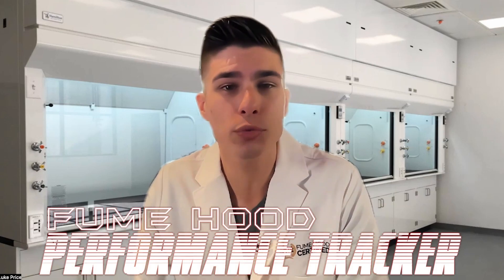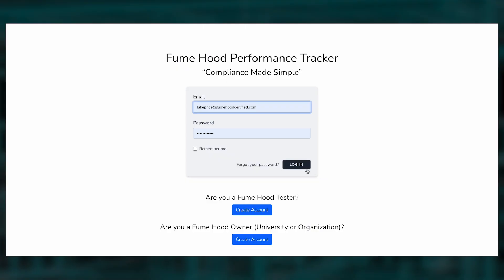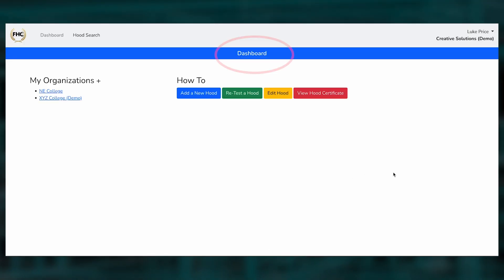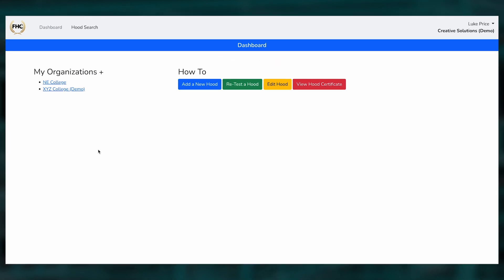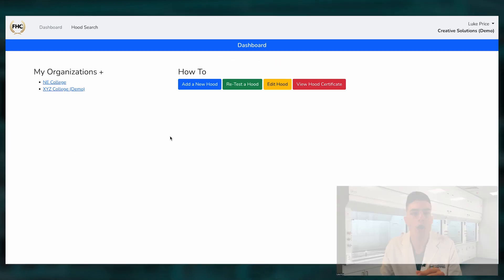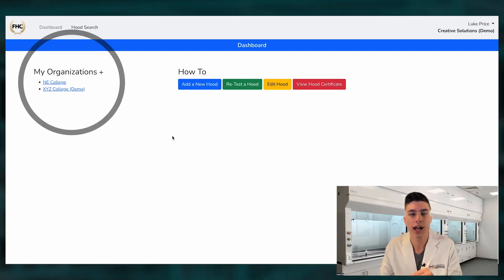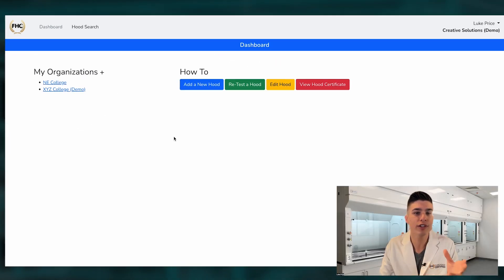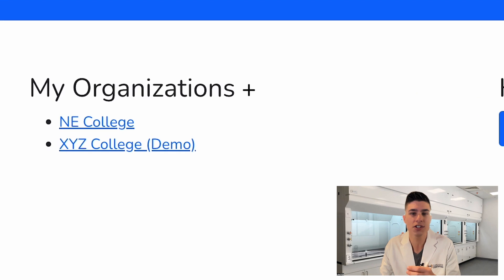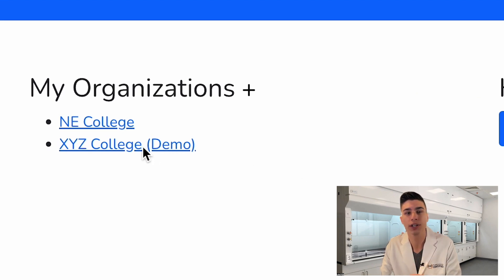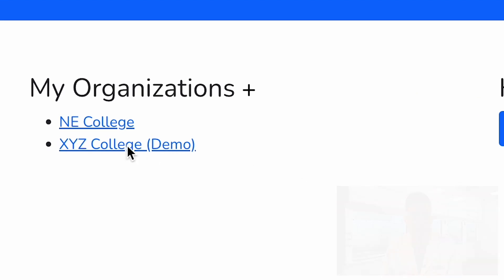So let's walk through the software quickly. Once you log in to fumehoodperformance.com, you'll see your dashboard. On your dashboard, you'll see all of your different clients or individual organizations that you test fume hoods for, listed under My Organizations.